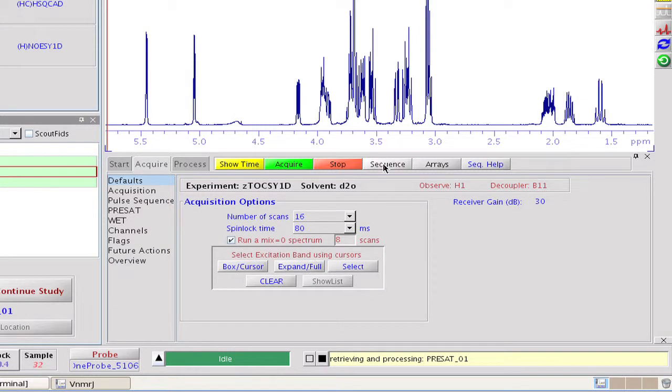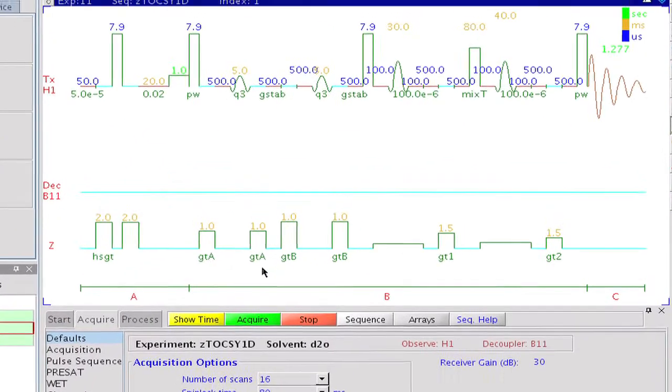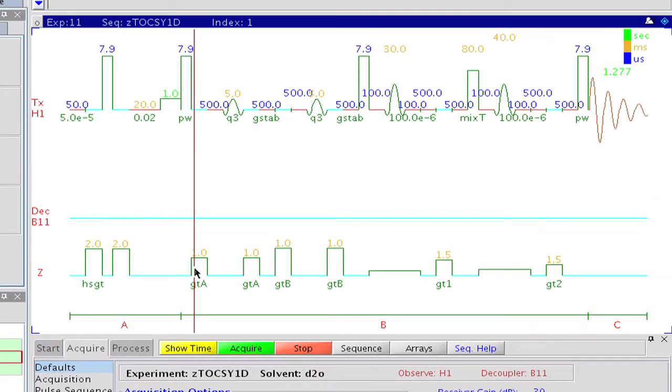In this particular implementation, selective excitation is achieved by a double-pulsed field gradient spin echo block incorporating two selective refocusing pulses on the target proton signal. It is followed by a Dipsy mixing sequence that transfers magnetization from the target proton to its scalar coupling partners.